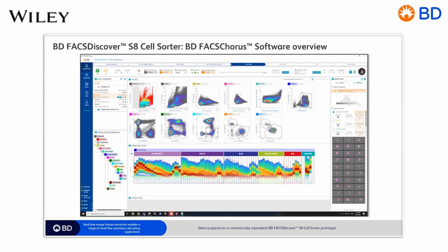And it gives you some image controls, which are very similar to other microscopy or even Photoshop image controls, where you get this histogram and then a max and a min, as well as a gamma control and some smoothing features, and all that is essentially cosmetic because it doesn't affect the actual data coming off the instrument. It's just how the images are shown, how bright or dim you want those images to be. So you have that granular control of each channel and then you can control which channels you want to see or not see.